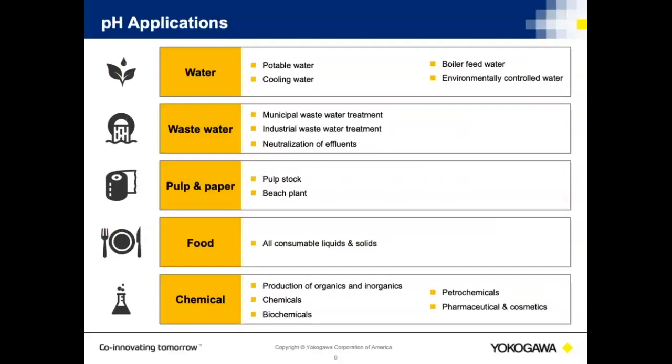High purity pH measurements present a specific issue. Wastewater introduces several other issues that we have to deal with. Mainly, the pH probes have to be constantly cleaned because they're in a very nasty environment.